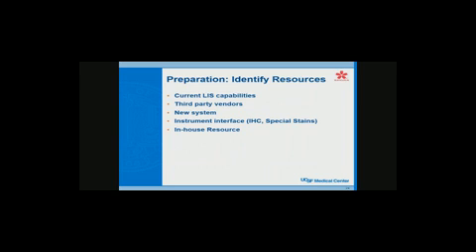So those things to think about. You have to talk to the vendor about the interface, whether it'll work with the system you're thinking about, and then the hardware that's involved in it.